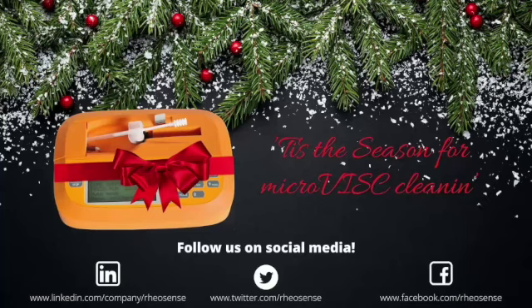As far as maintaining the chips, everything we've talked about in this webinar today will help you with that. Just making sure that they're clean and free of fibers after testing. That's the most important thing. As far as making sure the chip is good over time, I would just keep an eye on those parameters that we mentioned earlier, the R-square and the percent full scale, and making sure that your values are repeatable and consistent. In addition to that, we do offer calibration services. We recommend shipping your chips in once a year for calibration, and we can make sure that they're working in tip-top shape.